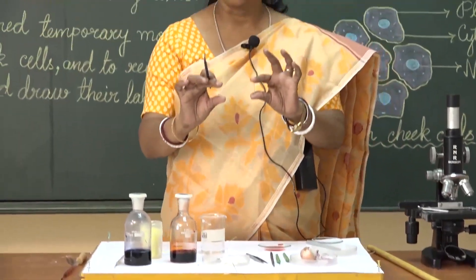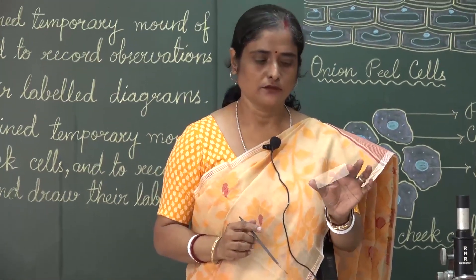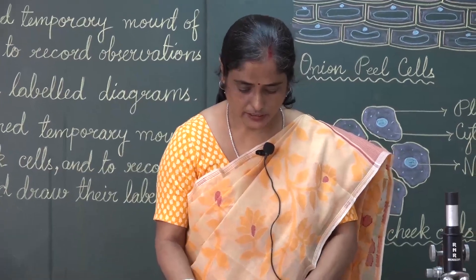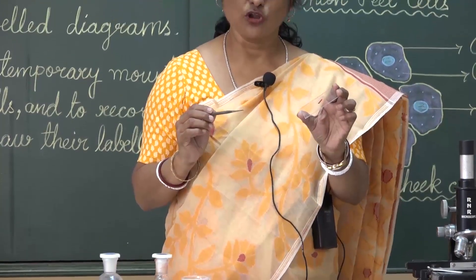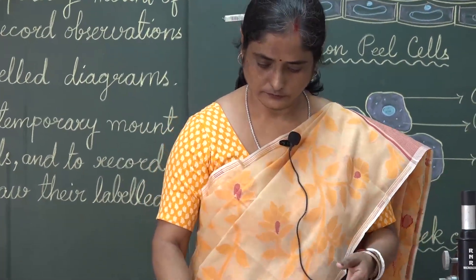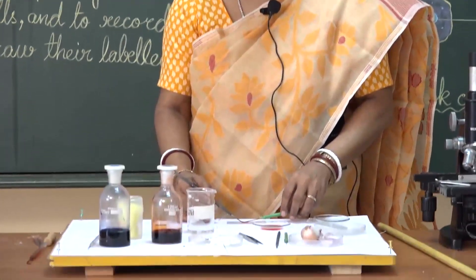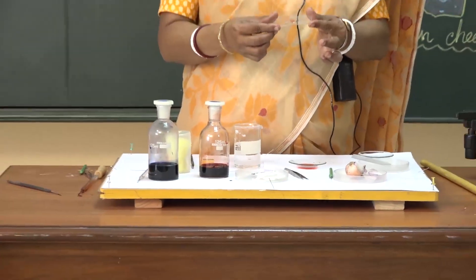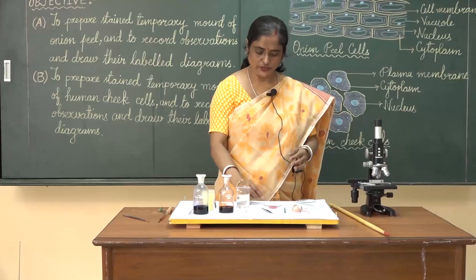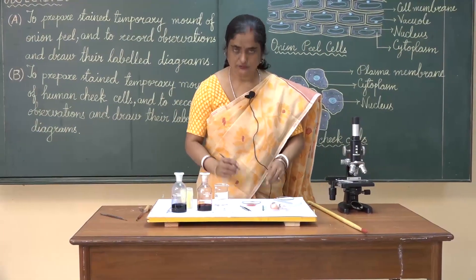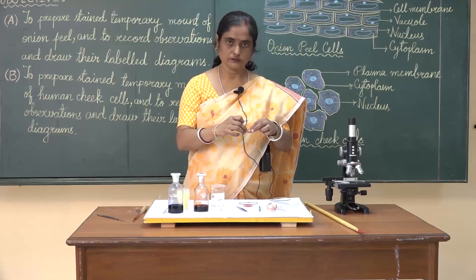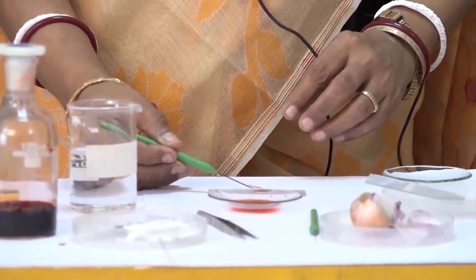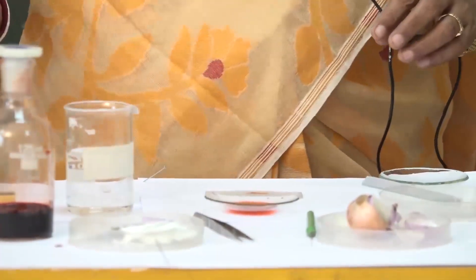Now, this is the slide — hold the slide always by the edges. You should not put your fingers inside, otherwise fingerprints will come on the slide. Then transfer the stained onion peel material with the help of a brush. The peel has a tendency to roll, so we have to spread it out with the brush. Then take a cover slip and place it on the material very gently so that there are no air bubbles.